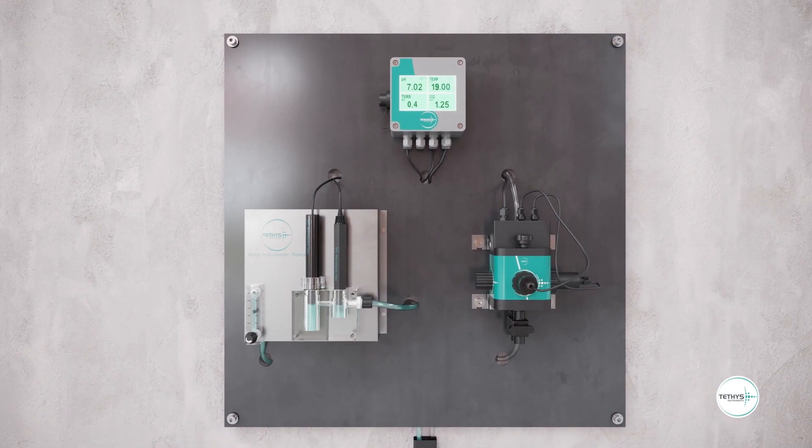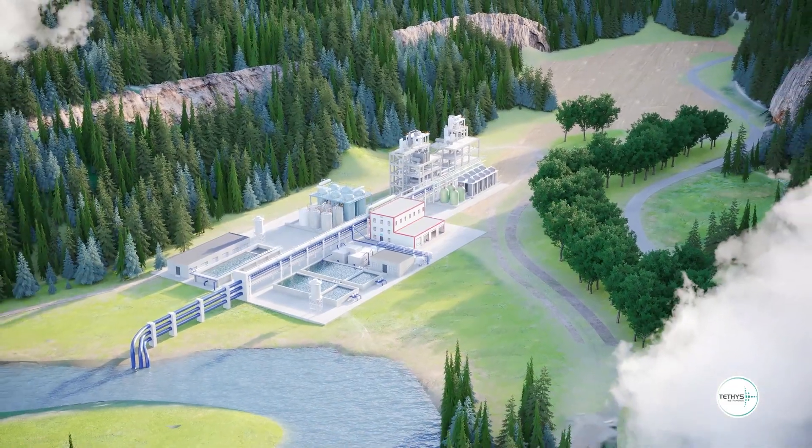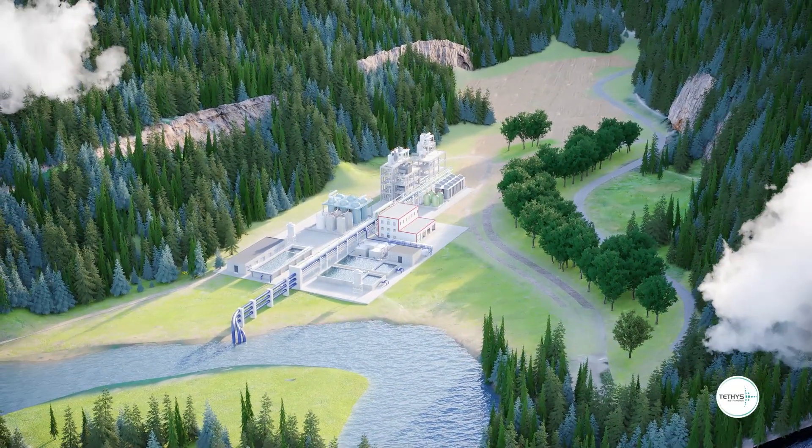Tethys Instruments has designed a compact 3-in-1 instrument for accurate and reliable monitoring of drinking water quality.